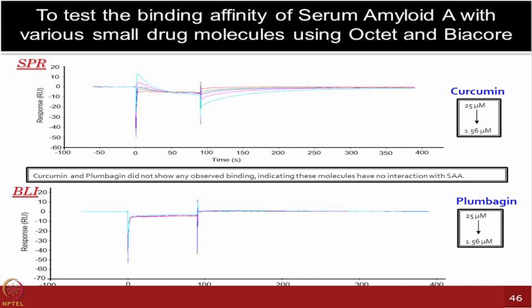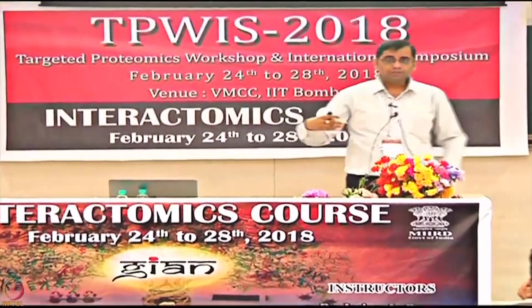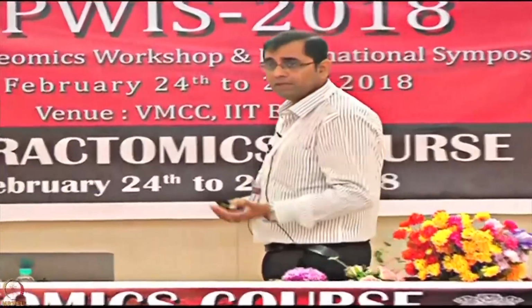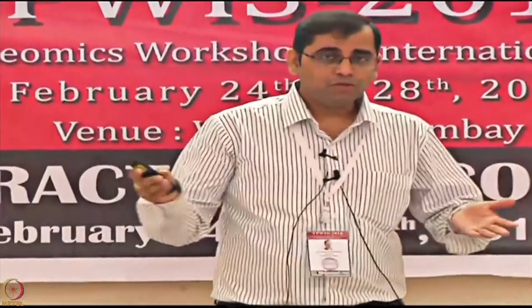So what I want to convey to you is that many times, don't just rush for one technology platform. Think about, if you have to test many compounds, what the cost can be and what the variations of doing those experiments can be. Start using those platforms which can narrow down your leads and hits. Then do the final experiments on something which is really acceptable. Of course, if you have a huge amount of funds available for the project, then you can do everything on the same platform, but otherwise you can mix and match and choose which technologies can give you what.